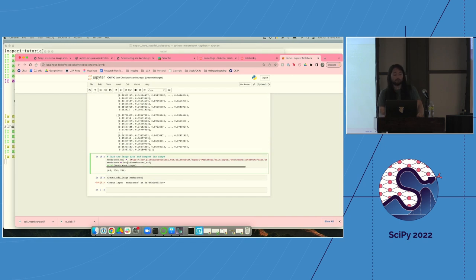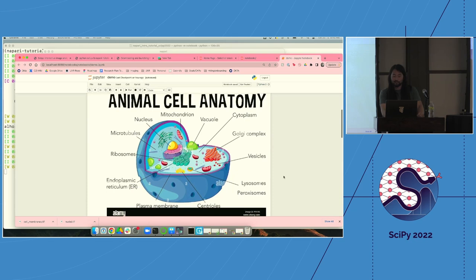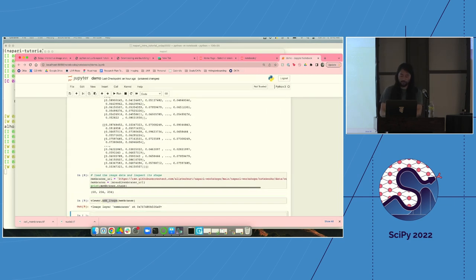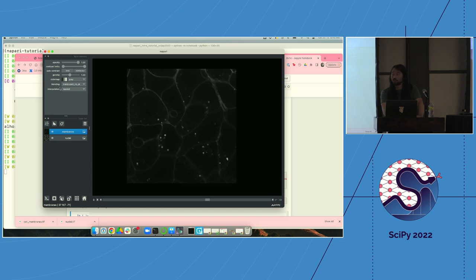Now I want to show how you can overlay multiple images at once, which illustrates why layers are useful. We'll load another image — this one is of the cell membranes, the outer boundary of the cell. Just like before, we add it using `viewer.add_image()`. You might notice the nuclei are no longer visible because the images are on top of each other — you can toggle visibility with the eye button. When you select a layer, the layer controls update for that layer.